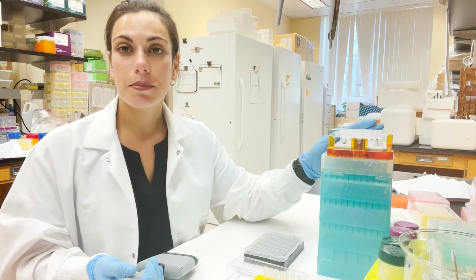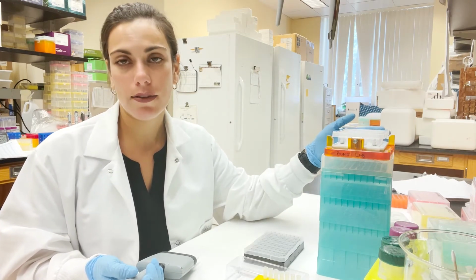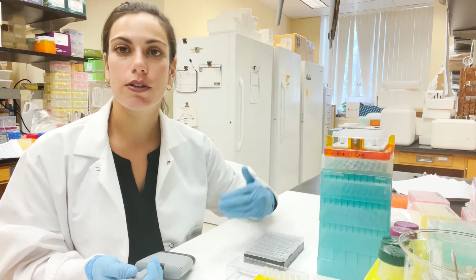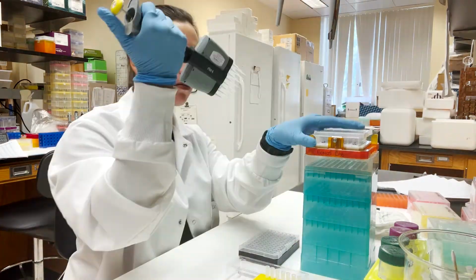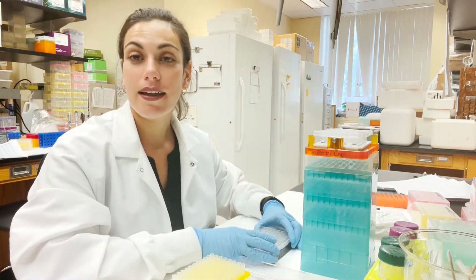Okay. After this sits on the plate for about 1 minute, we pipette as much of it as we can, in this case 37.5 microliters of our clean DNA, into a new plate so that we can use that for PCR. And that's the end of the step.